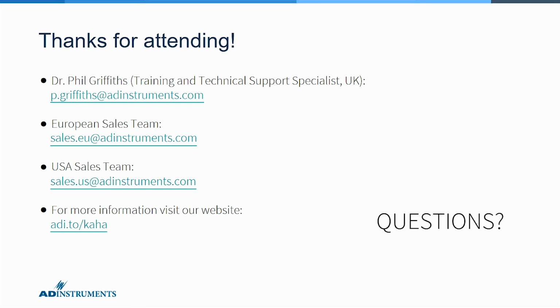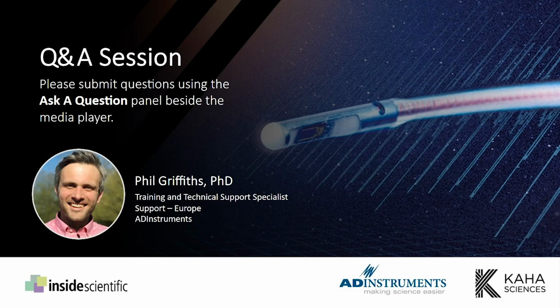I am just going to flip to our Q&A session. So the first question here for you, Phil, is does the wireless charging of the implants cause the animals to heat up at all?